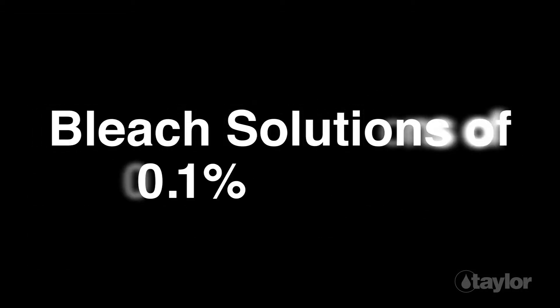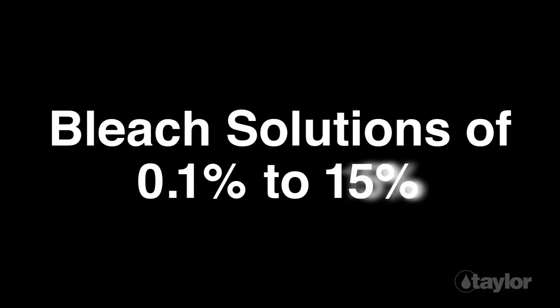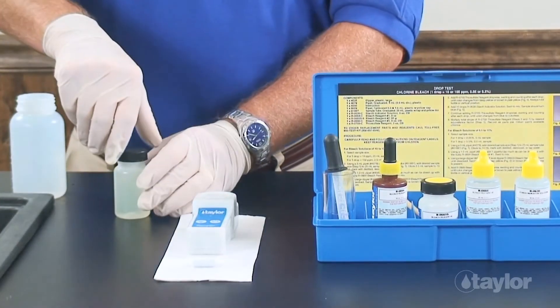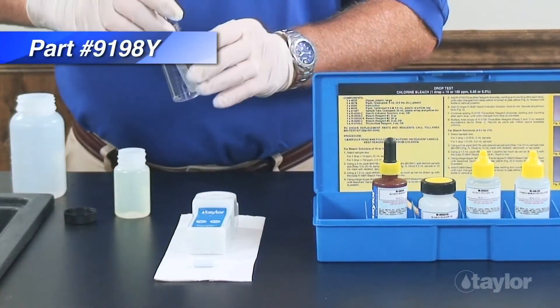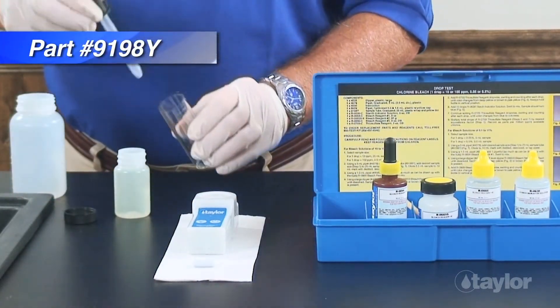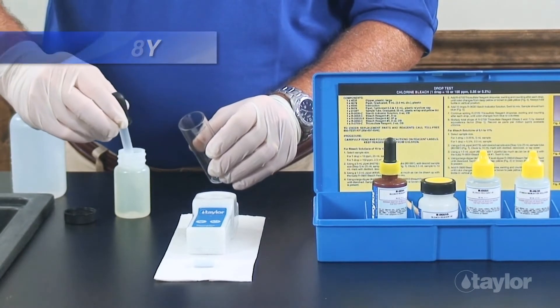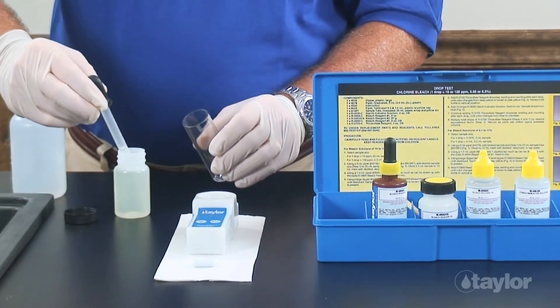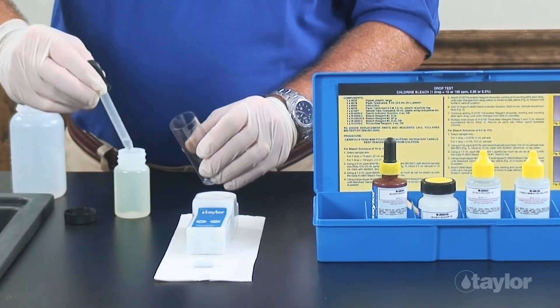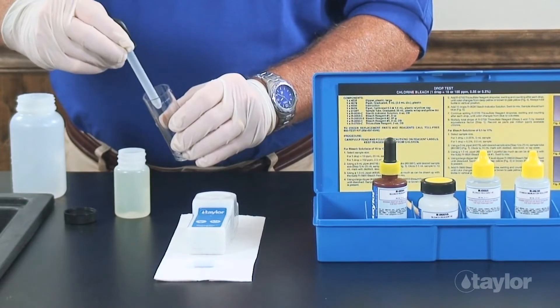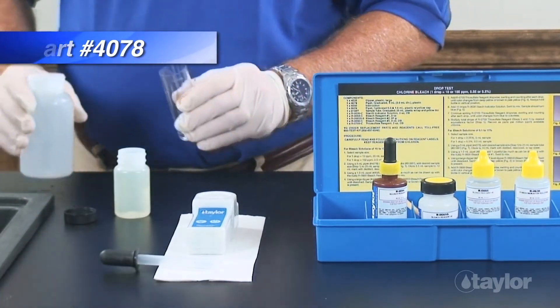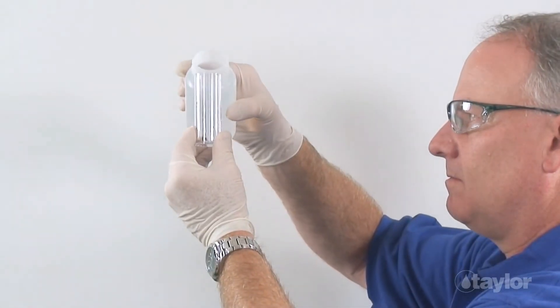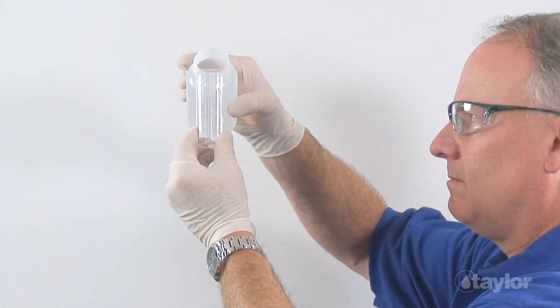Today we'll be demonstrating the test for bleach solutions of 0.1 to 15 percent. Select the sample size you prefer — either 0.5 milliliters or 5 milliliters. We'll be using a 0.5 milliliter sample. Add the 0.5 milliliter sample to be tested to the sample tube using the 3 milliliter pipette, then dilute to the 10 milliliter mark with distilled, deionized, or tap water.